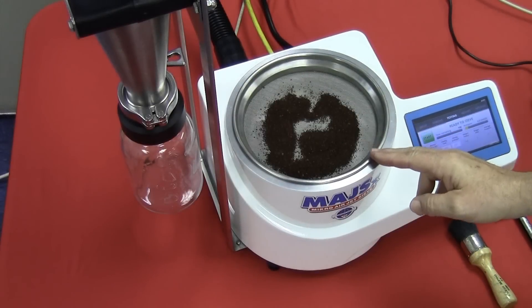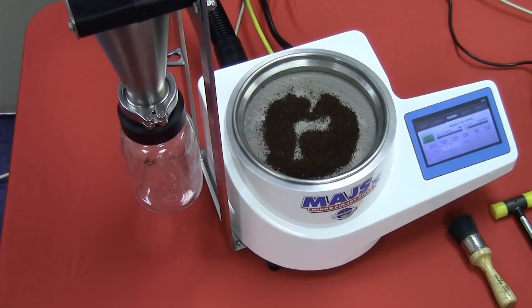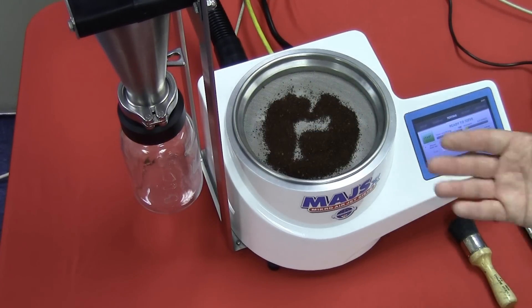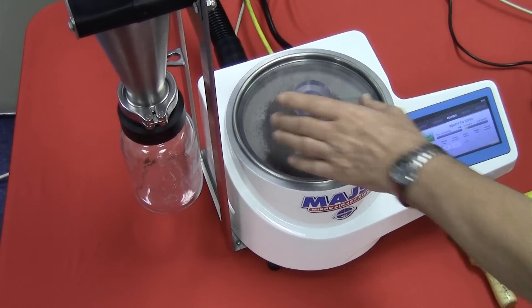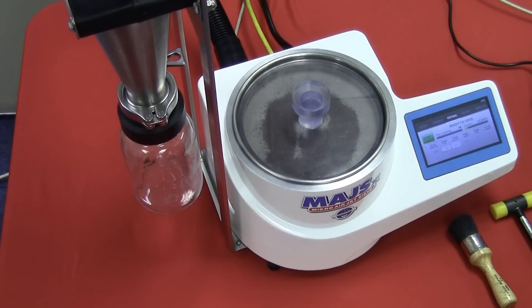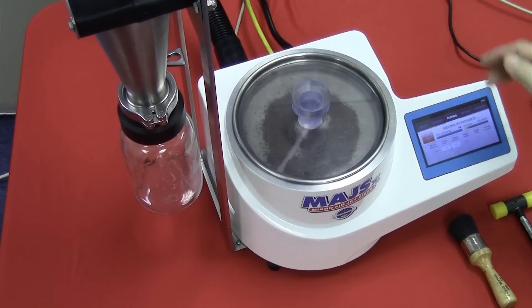We will now demonstrate the pneumatic sieving principle. As you can see, the material has been placed on the screen — it has already been pre-weighed for demonstration purposes. We then place the cover on top so that we can generate the negative pressure while the air distributes the particles, as you will see momentarily.